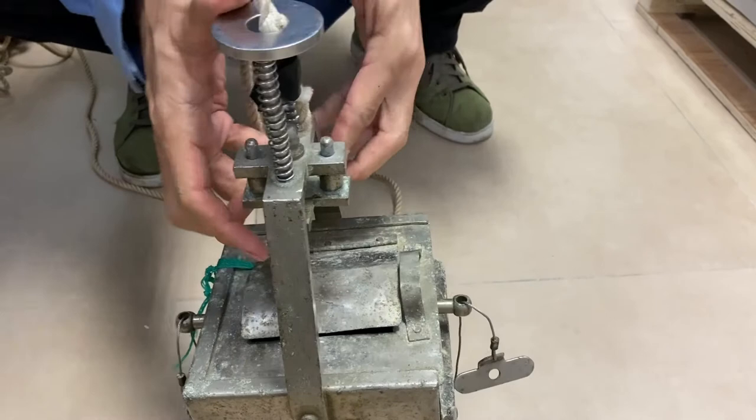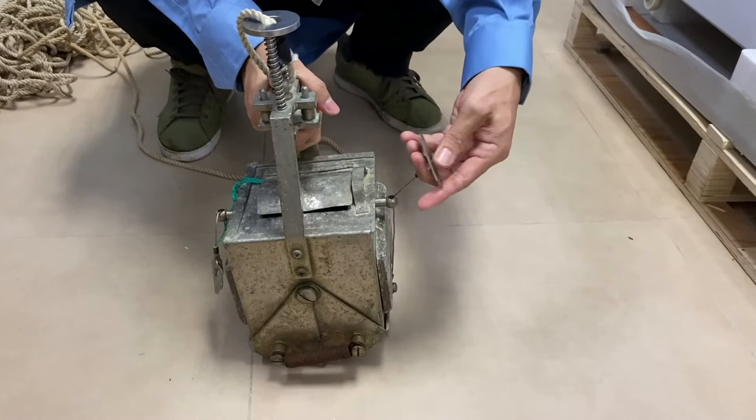So this is how you set it up. First, you have to open up the mouth of the Chora.